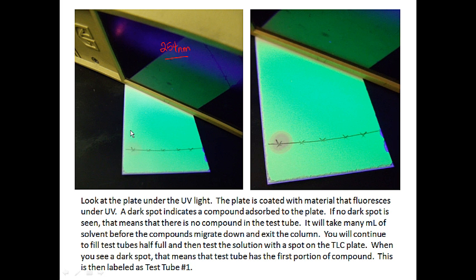So we continue this process. Every time a test tube fills up halfway, we put a spot on the TLC plate and put it under the ultraviolet light. If we see no dark spot, then we just continue on. The first time that we see a dark spot on a TLC plate, that's the first test tube that contains the component. We're going to call this spot number 1, and that test tube number 1. Up to this point, no components have eluted off the column.